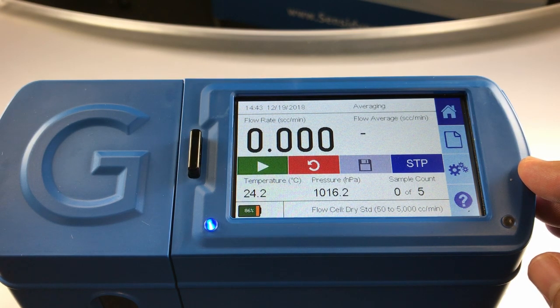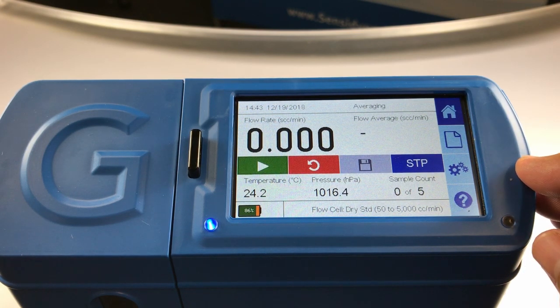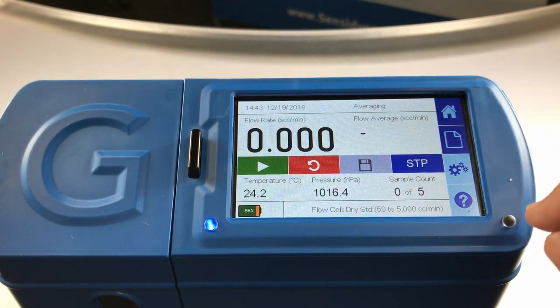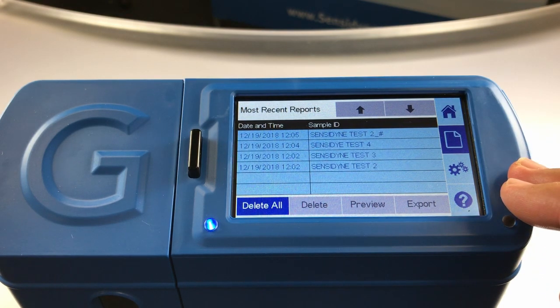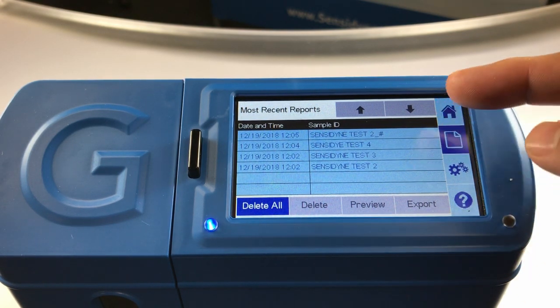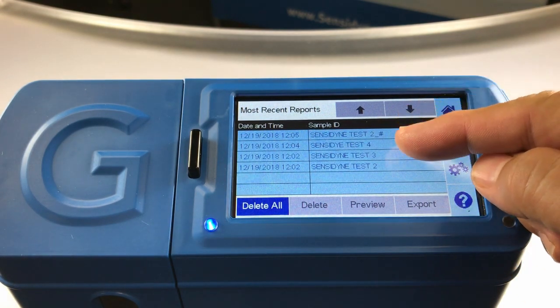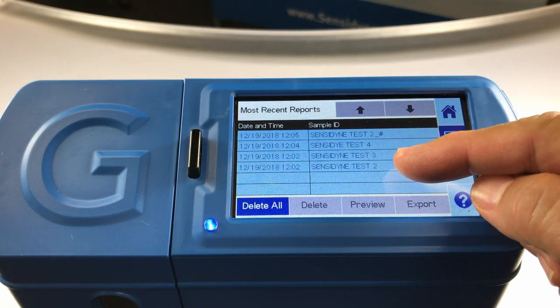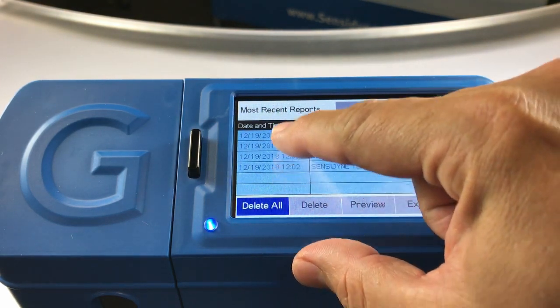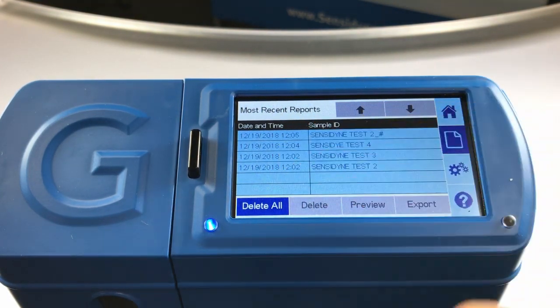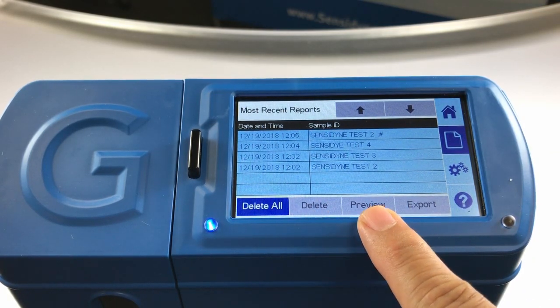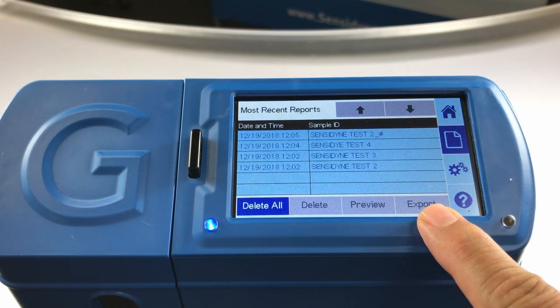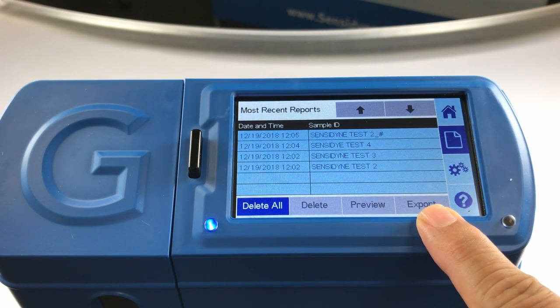To advance to the report screen, hit the report icon on the menu bar. On the most recent report screen, you will have a listing of your calibration reports by sample ID, sorted by date and time. You can delete all or delete a single report. You can preview the report as a bitmap or export the report to an SD card.